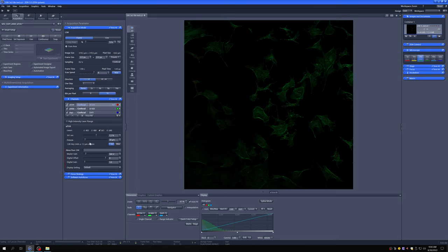So you can see here, there's a thing that says pinhole. There's a slider. I can move the slider, and as I move the slider, this number changes, this number changes, and this number changes.